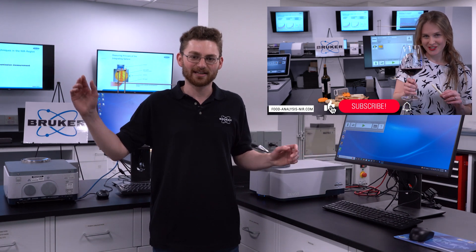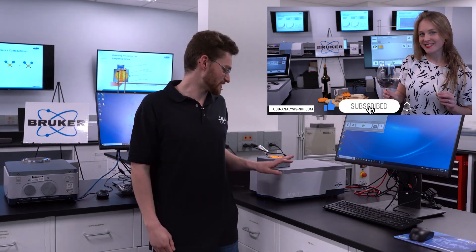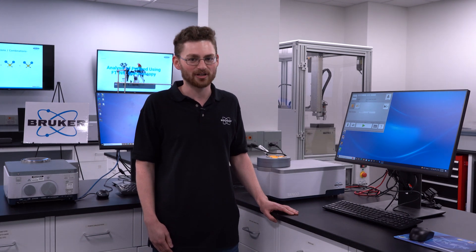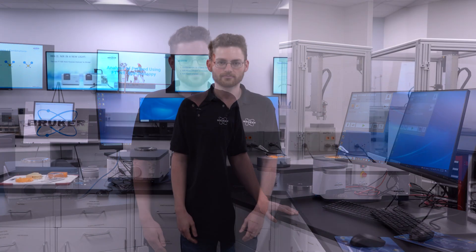Here in our Madison, Wisconsin lab, we showed you how quick and easy it is to use the Tango to measure cheese. Now is as good a time as ever to take a deeper dive into that cheese analysis.